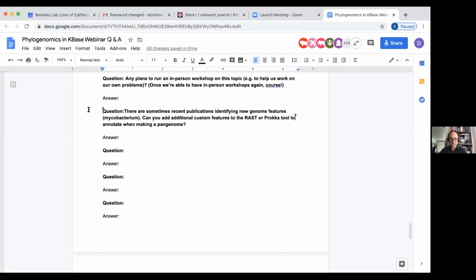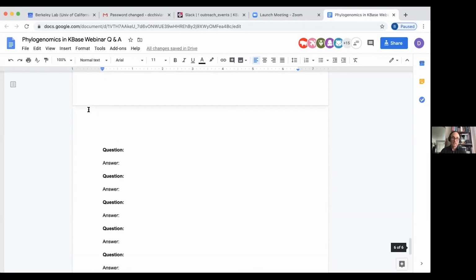So you could take the assembly sequence as a FASTA and the gene coordinates as a GFF, edit the GFF, upload both to your staging area, and then import the GFF plus FASTA as a genome object, and then you can dive into all this tooling with that object. But yeah, you sort of have to do it manually offline at this time.